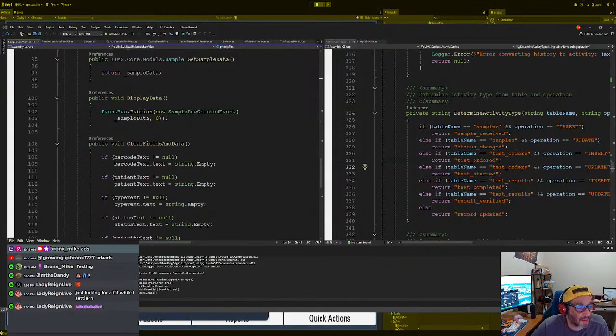Click once. That's good. There we go, double click. Good. So now we can scroll and double click. Are we getting the actual data? Basic metallic, edit. Lisa, yeah, we are getting the actual data. So you see things like this, we've got to change the lettering or something like that, but it looks good.